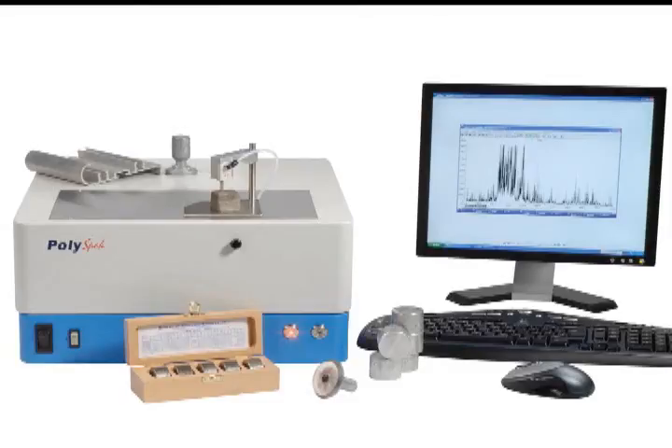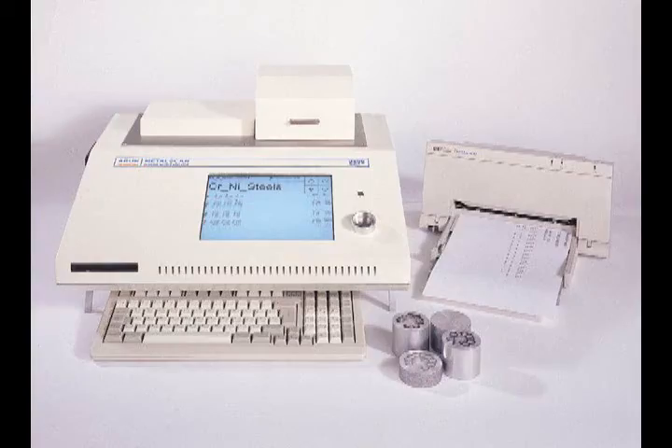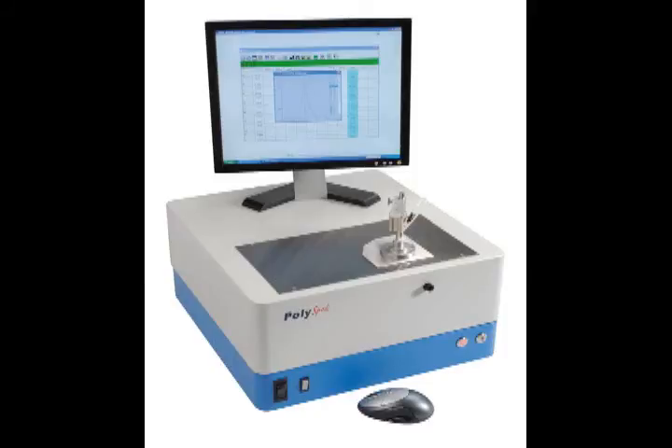Introducing the PolySpec series of desktop metal analyzers from ARUN Technology. The PolySpec is the latest in a long line of CCD-based spectrometers from ARUN Technology, the first company to produce CCD-based spectrometers for metals analysis. Since 1988, the company has produced over 1,000 units for use in over 30 countries worldwide and for a variety of applications.